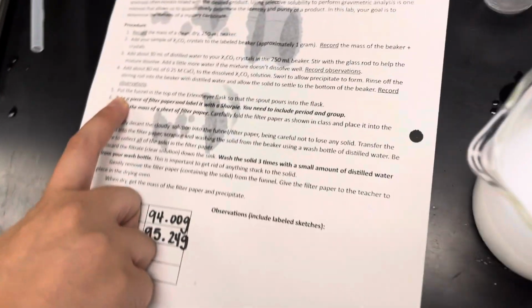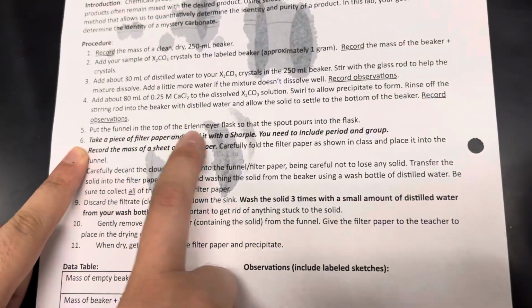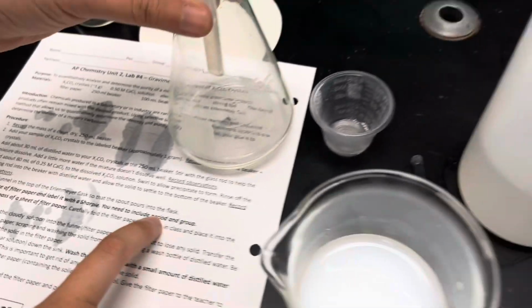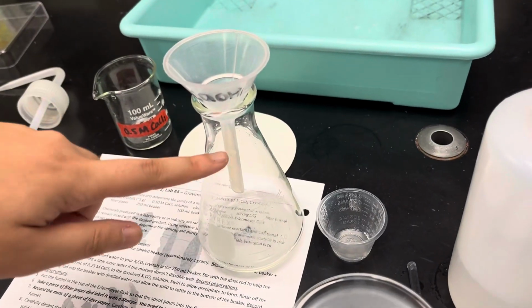Let's go to step number 5. Put the funnel in the top of the Erlenmeyer flask so the spout pours into the flask. So we already did that over here. So we have our funnel and it's going to go into the flask.